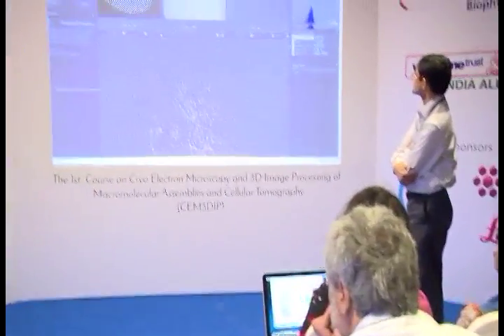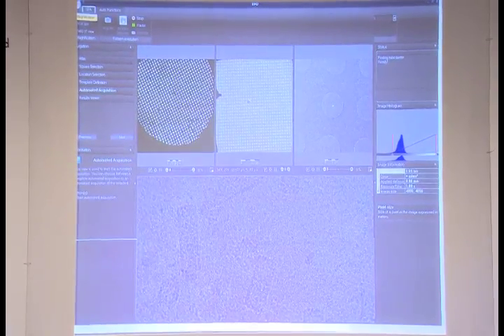So you go to holes, then you have this whole image, how the program is collecting. That image, I have looked at your one slide, they also looked very crispy. Can you go back? Yeah, this one. Down here, it looks like that is a very high defocus. But when you collect from the EPU and look at them on a different computer, they look different. So there is something different here.